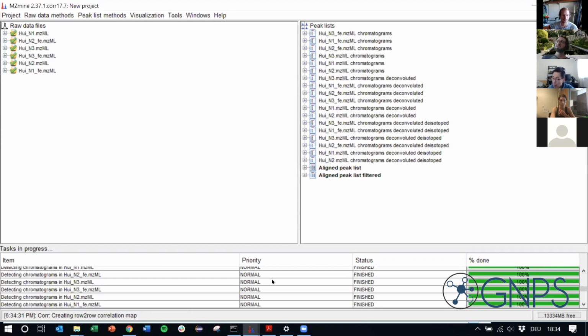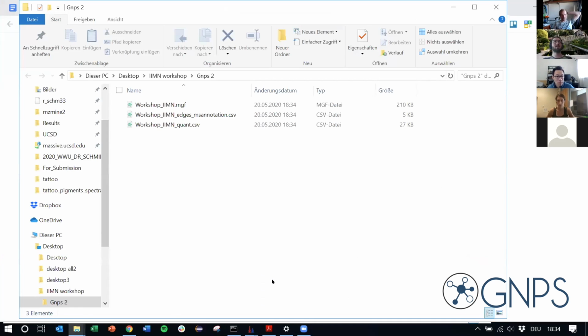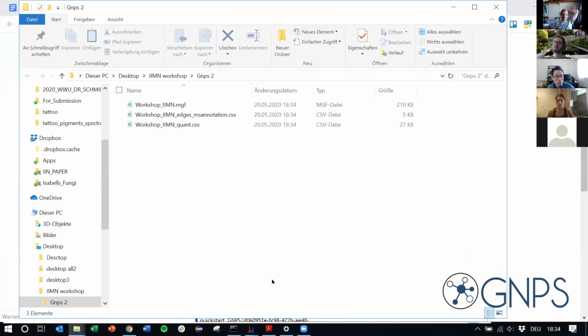Usually I use gap filling, but afterwards I specify more filters for the feature shapes. I would then define, let's say, that I definitely need 3 data points on the feature and so on. So yeah, we just skip this here. And for me it already finished.